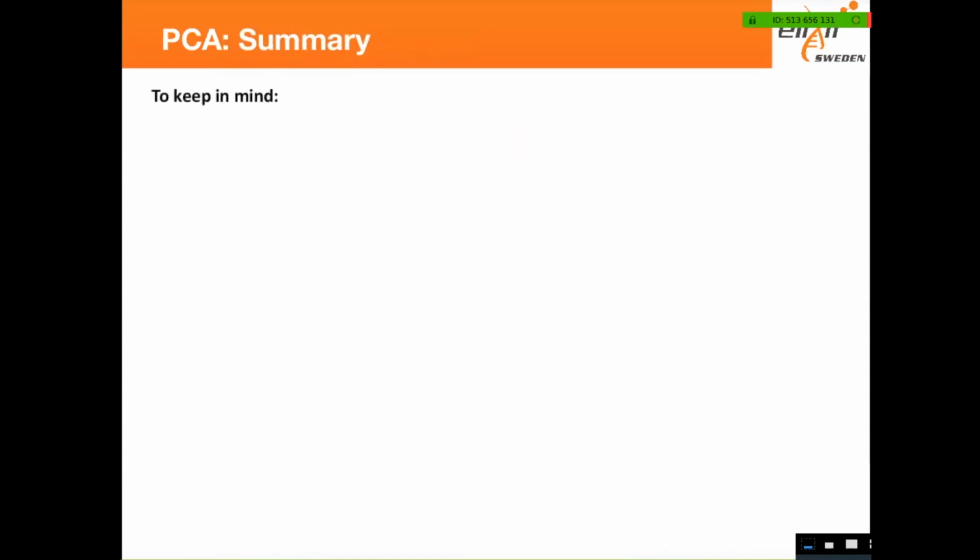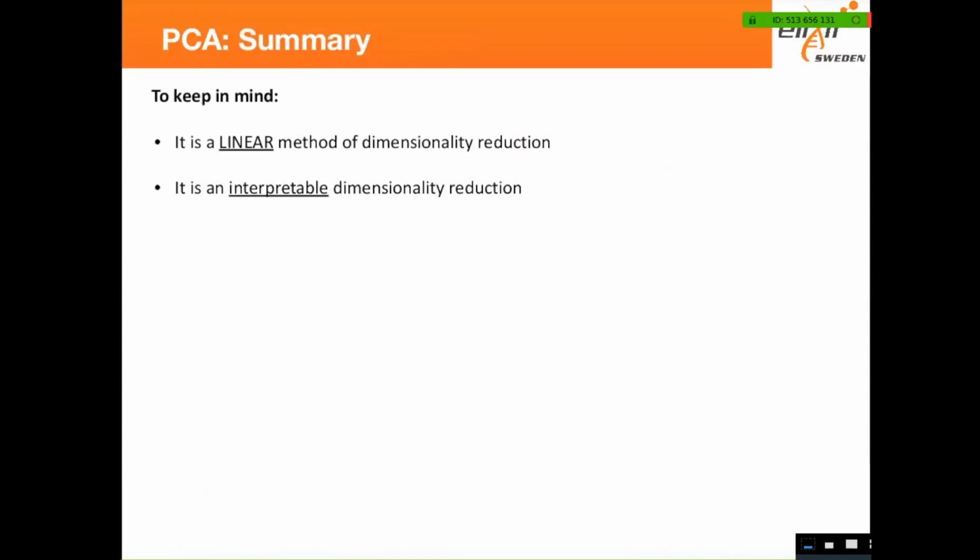So in summary, principal component analysis is a linear method for dimensionality reduction. Each principal component is interpretable. So you know that principal component 1 has more variation or less variation. And they mean something. So maybe some genes impact on that principal component compared to principal component 2 that other genes contribute most. So the data is usually scaled. So the mean expression of every single gene should be 0, and the standard deviation should be scaled, which is z-score normalization. And that's here, z-score. You can also do that by hand. Or if you're using the Seurat package, there is a function ScaleData. And that's why you do that function before computing PCA.